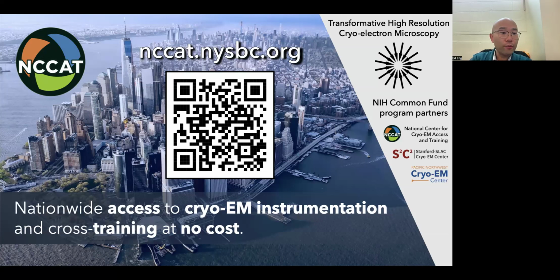On the instrument front, we are upgrading half our instrument profile to new energy filters and direct electron cameras, for example, the Falcon 4i. So expect to hear more about that. In terms of our workflow, we are changing our workflow to incorporate coded grid boxes. So if you are an upcoming user or an active user and have not received your grid boxes, let us know.